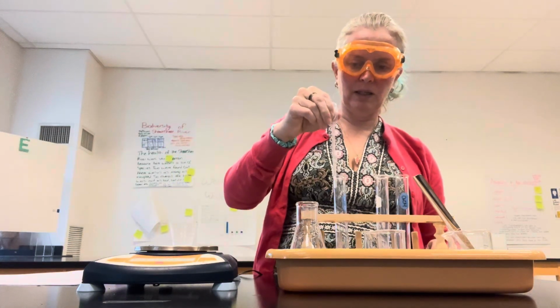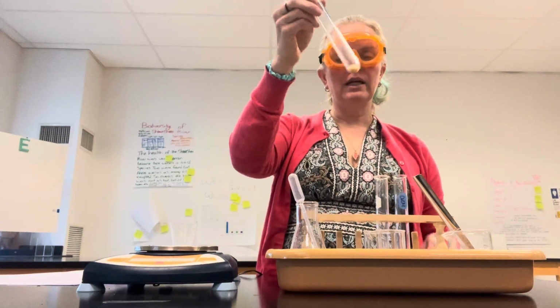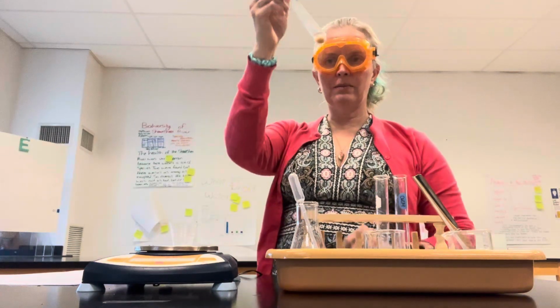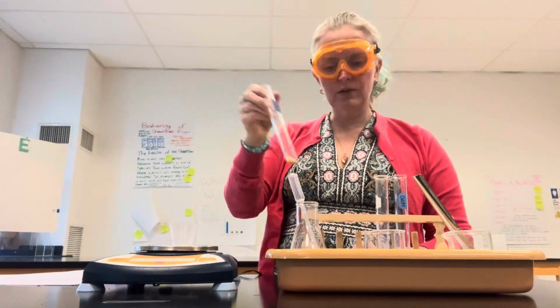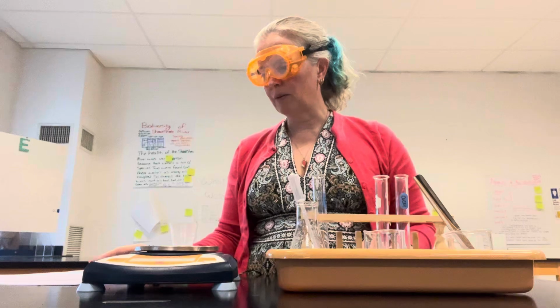So that's why this is a mini lab. It's a pretty short procedure. Each person will have 1 mixture to make, and after you make the mixture, you wanna examine the mixture, notice whether it dissolves or not. One of the mixtures will involve the 2 powders, so that should tell you something about that.